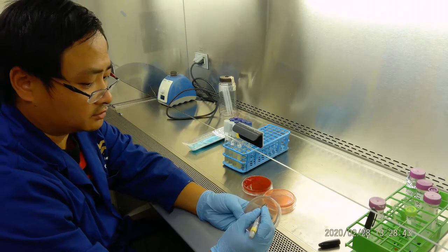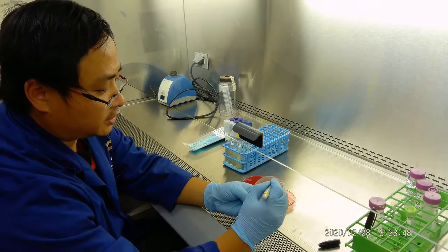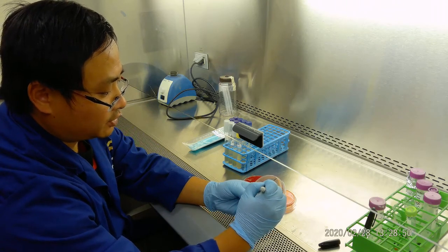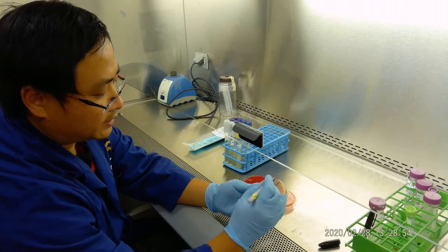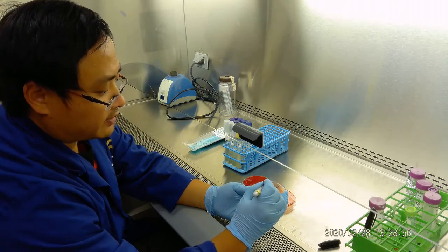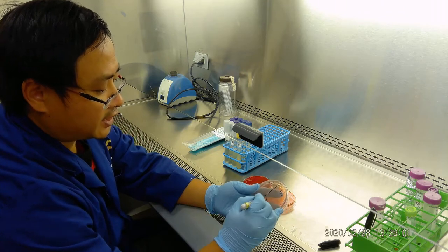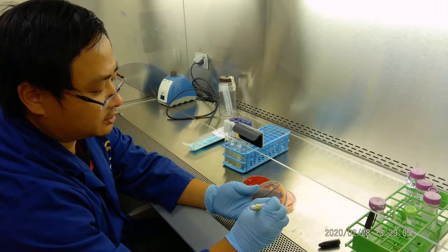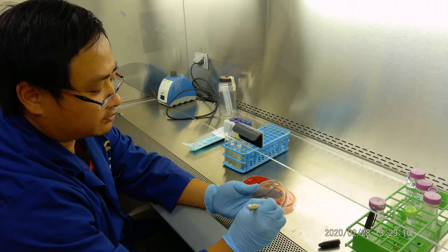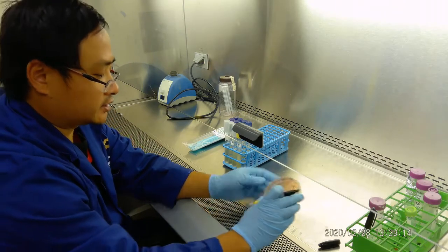Lee, take a picture right here. We have to do a label. We have a MacConkey agar, so we do the label. We will split them into 3 sections. So we want to label them as Staphylococcus aureus, E. coli, and Pseudomonas. Now, of course, you have your initials, date, and also your bench number. Okay, so that is for MacConkey agar.